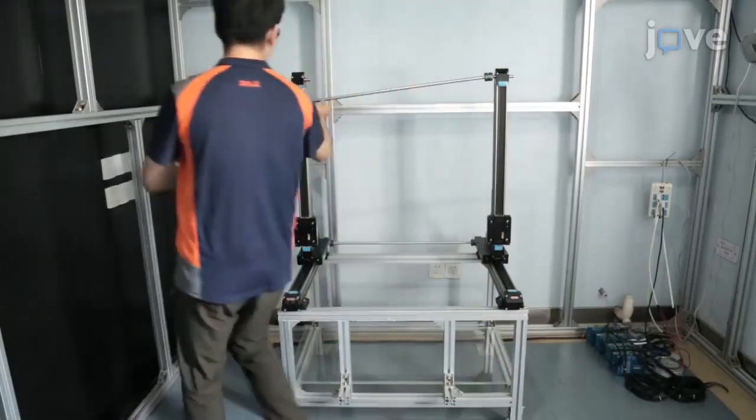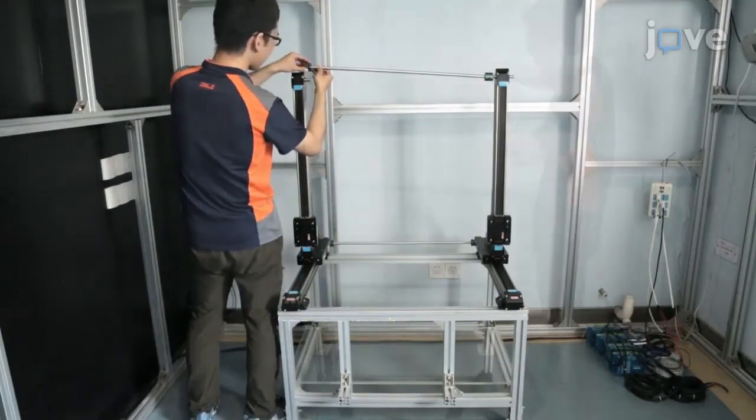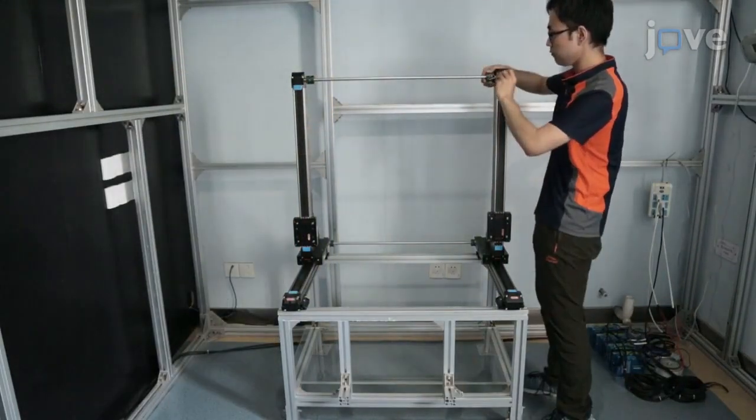Connect the two Z-rails with a connecting shaft and diaphragm couplings and tighten the lock screws of the couplings.